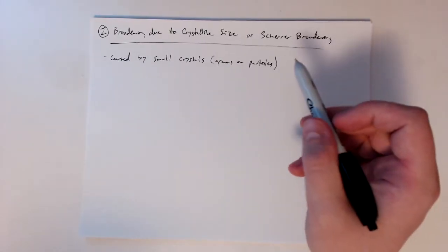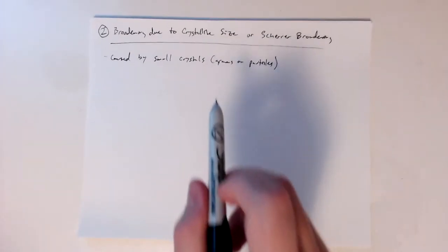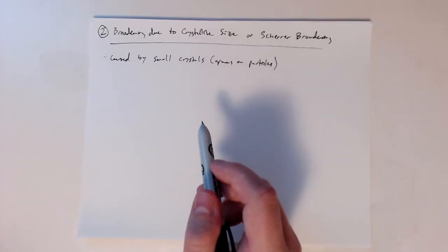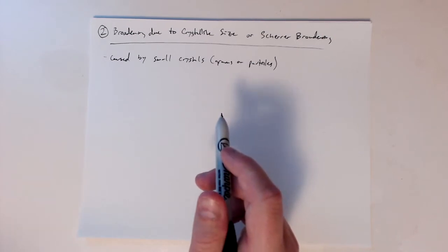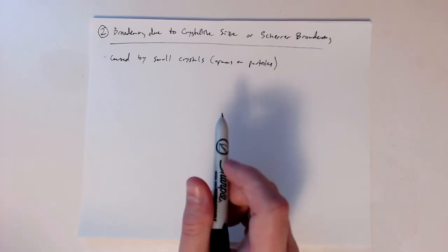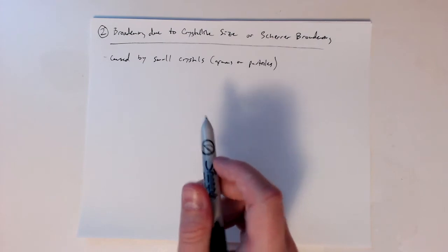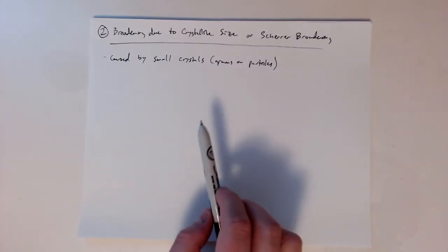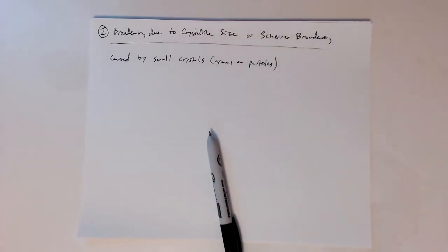And so the reason that small crystals can do this is because there is beam divergence and convergence from incomplete constructive interference, unlike what you would see in a much larger crystal. So, excuse me, it's best to show this on the slide, so I'm going to switch over and show you what I'm talking about when it comes to this incomplete constructive interference.